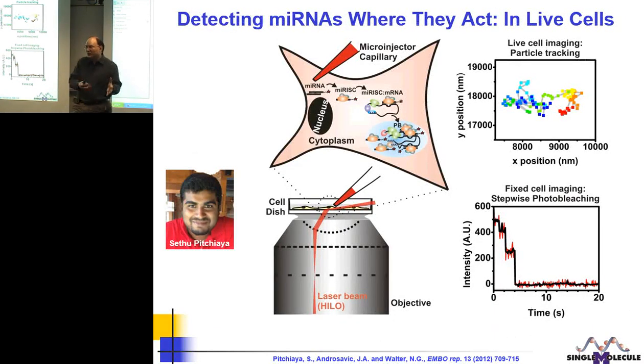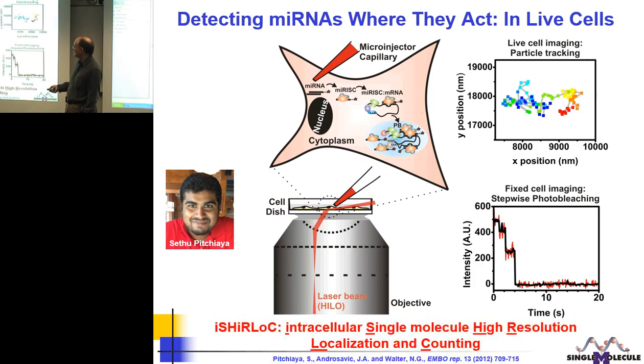Now, how did we address this question of what goes on in the cell using our single molecule tools? We developed this technique that I refer to as iSHiRLoC, intracellular single molecule high resolution localization and counting, a mouthful to indicate that we are Sherlock Holmes looking inside the cell. And in this case, what we do is we microinject a fluorophore-labeled microRNA.